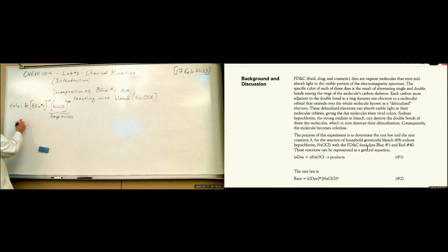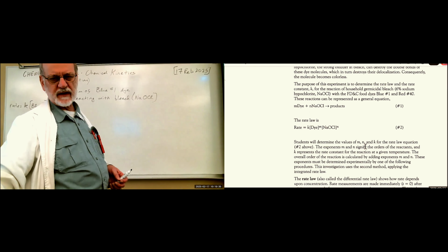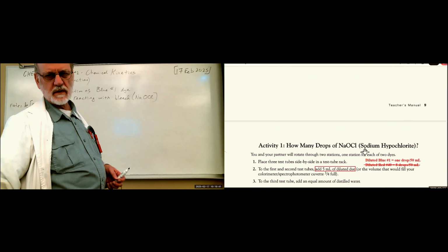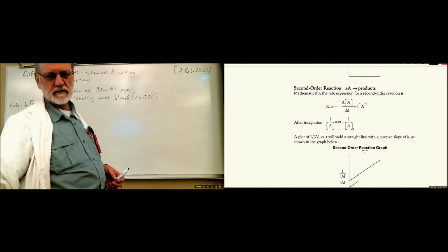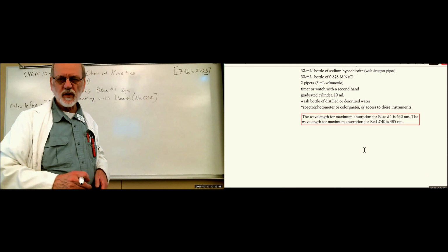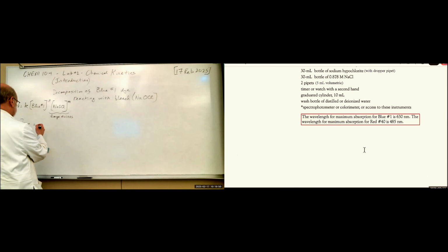So we have a wavelength of maximum absorption for the blue, and I think I put that in here. There it is. Blue number 1, 630 nanometers.